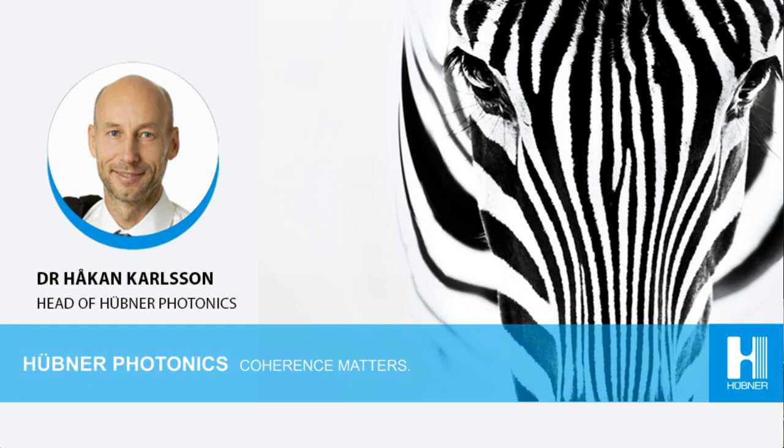The main difference is that the diode-based lasers have a little bit lower spectral purity, so they need some kind of cleanup filter. If you want to do low frequency Raman spectroscopy with the diode-based laser, you have to think about having a very narrow line with a cleanup filter, like a VBG-based one.